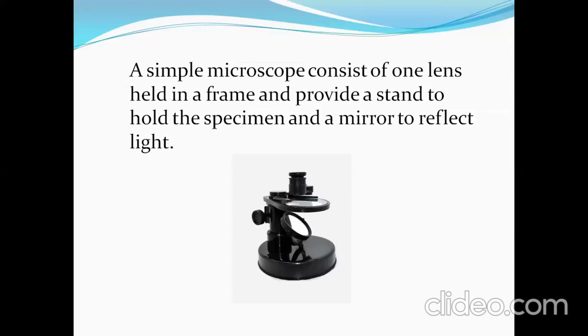And what is the application of this simple microscope? It is normally used to study the different floral parts in plants or different appendages in animals. I am just speaking about its application in the biological field. It is very commonly used in the taxonomy laboratory, where the different floral parts are analyzed, when we study the different plant parts. So this is the simple microscope.